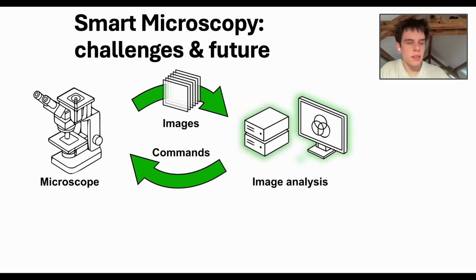All right, in this last section of the talk, I want to take a step back and look a bit more general at smart microscopy and what the challenges are, especially on a technical level. By smart microscopy, I refer to any kind of feedback loop where we use real-time image analysis and use this to control the microscope in a clever way.